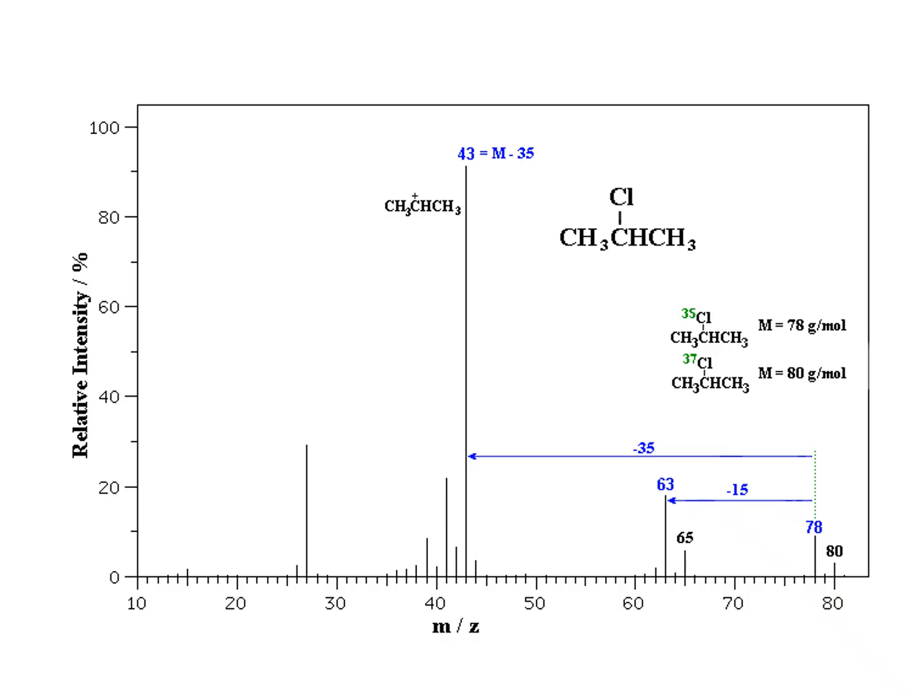So what we would then have as the structure of that particular fragment will be CH3, CCl, H with a plus on that carbon. If we look to the other side of the spectrum, we may see a small peak at 15. So there'll be a CH3 peak, and then there'll be a CH3CClH peak, and those two pieces will connect to each other to add up to 78.